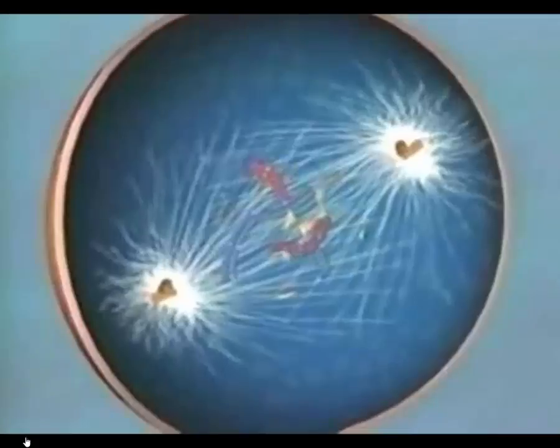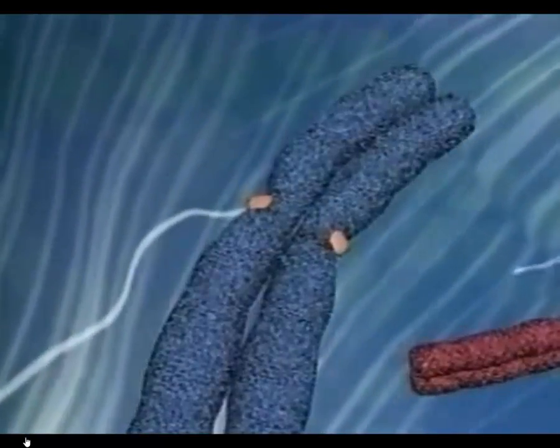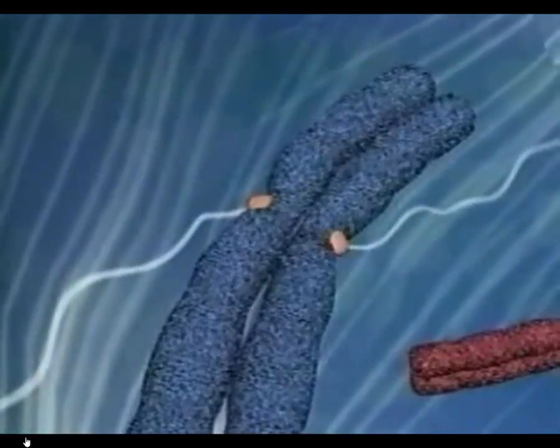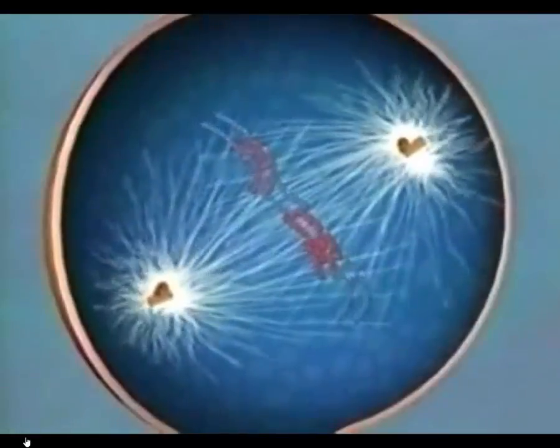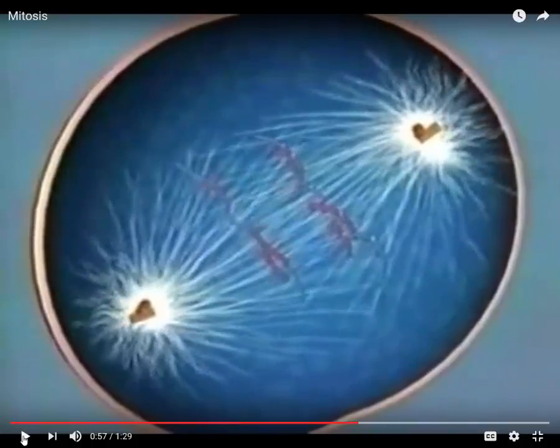That's the next phase of mitosis. And what is that called? Metaphase. Meta means middle, so they're lined up in the middle. With amazing accuracy, a spindle from each centriole attaches itself to each of the chromosomes. Assisted by the protein fibers, the chromosomes move center stage. In a microscopic tug of war, the spindles pull each chromatid toward opposite poles. So this is the next phase. When the chromosomes are being pulled apart, what is that phase? Anaphase, being pulled apart. So ana, apart.